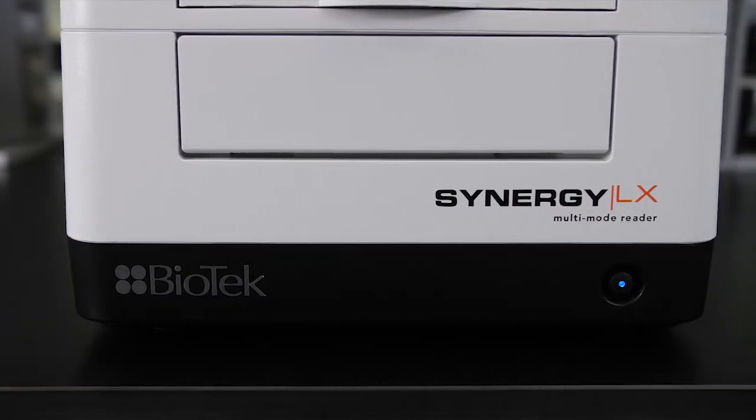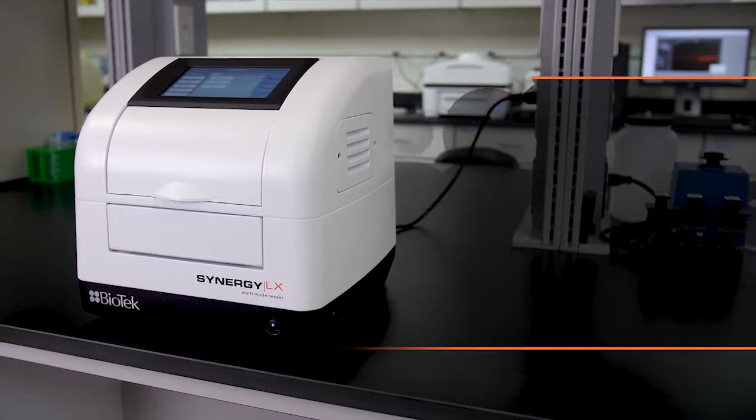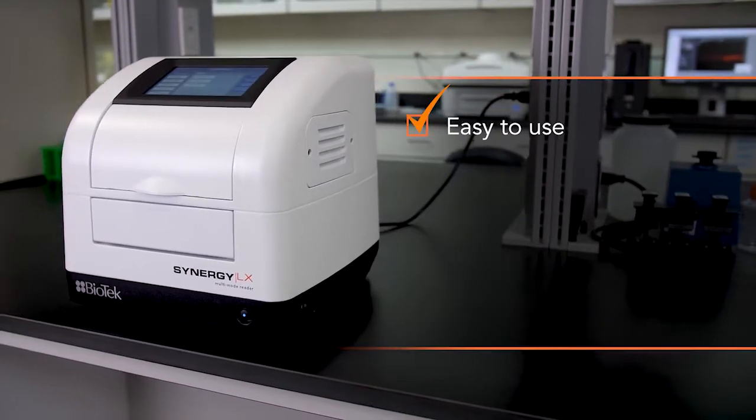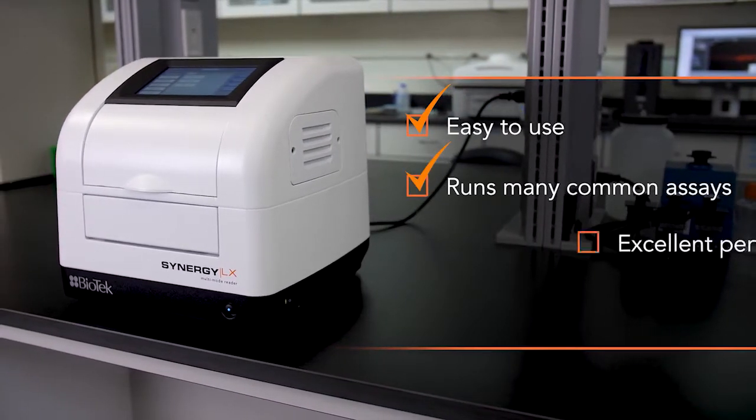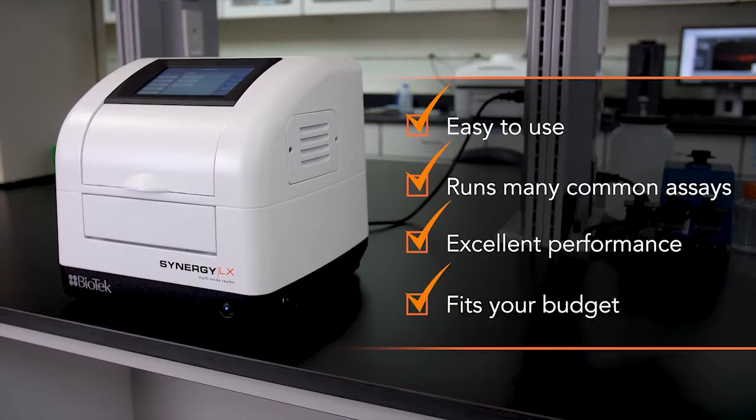Biotek's new Synergy LX multimode reader checks all the boxes on your requirements list. It's easy to use, runs many common assays, has excellent performance, and fits your budget.